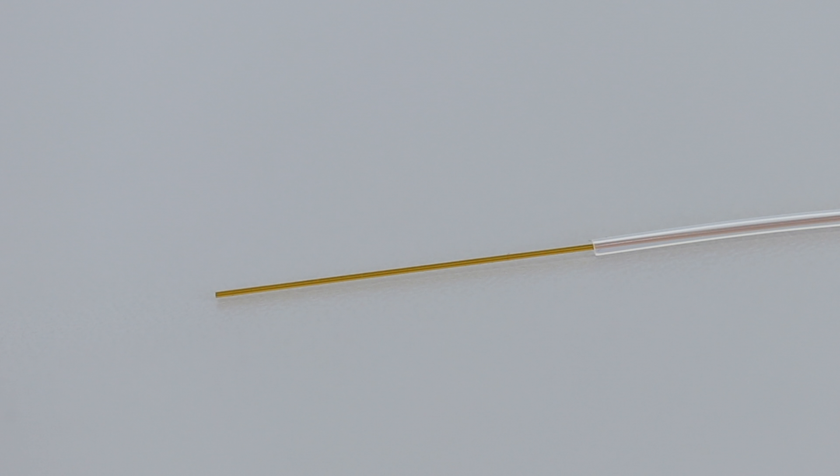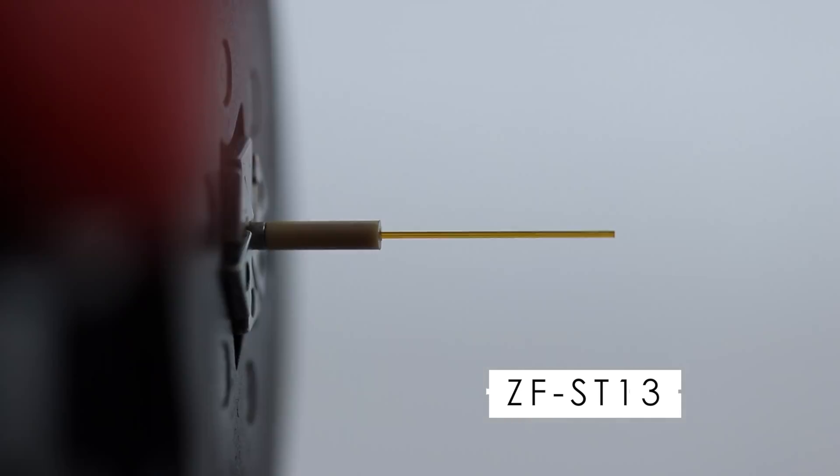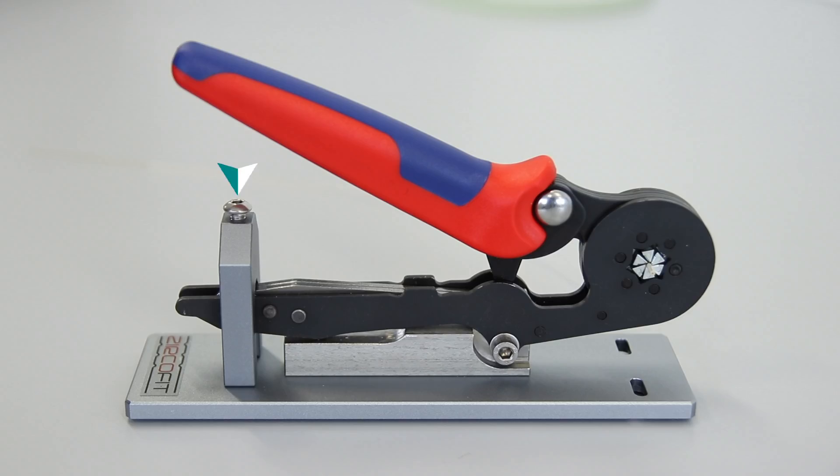After combining the tubing and the capillary, install the ZF-ST13 sleeve on one end and place it on the crimping tool. After pushing the fused silica into the sleeve, use the crimping tool.